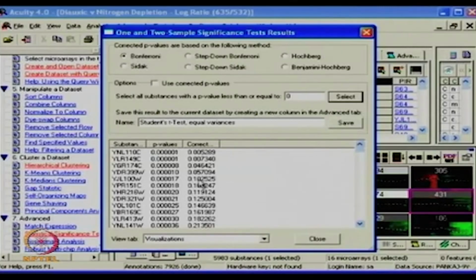Another important thing is multiple testing corrections. It also gives an opportunity of correcting with different correction types, say for example Bonferroni, which is being used, and Benjamini-Hochberg. So they are different ways of correcting for multiple testing. You can apply different ones and look more. Preferably Bonferroni, which is the more stringent type. Benjamini-Hochberg is a little more lenient on the multiple correction.